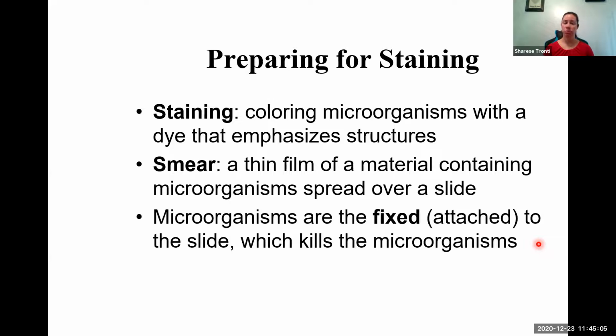First, you're going to have to perform a smear. A smear is the procedure for smearing bacteria or any kind of microbe on the slide. Once you have your microbe on the slide, then you're going to have to fix it onto the slide, or attach it. That can be done in different ways, but the most common way is by using heat. So we performed our smear, we have bacteria on the slide, and then you're going to heat the slide, and that's going to fix it.